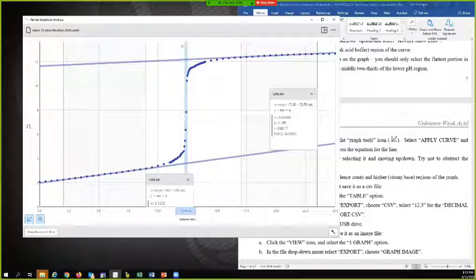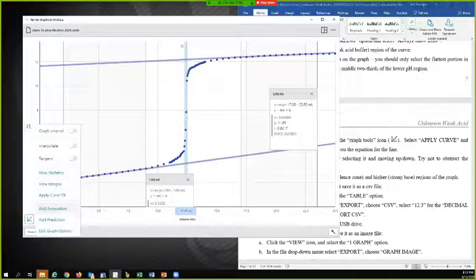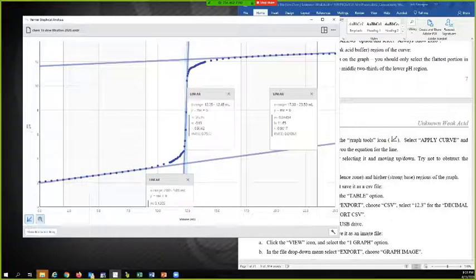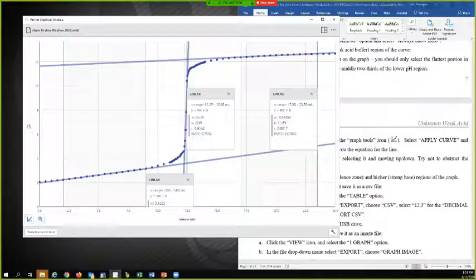There we go. And again, I'm going to go over here to this icon, apply curve fit linear. There we go.